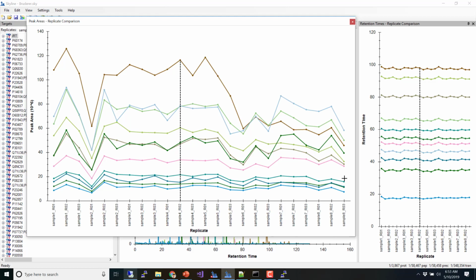Okay, so now another important thing to look at is, does anybody know, were these collected in this order? I have no idea, right? So maybe something happened to the instrument, and everything goes down toward the end, or maybe this was a bad run and something broke. But we'll get some new insight if we look at the acquired time, because acquired time actually is really an important factor in mass spectrometry.